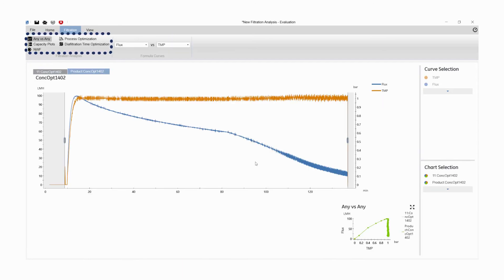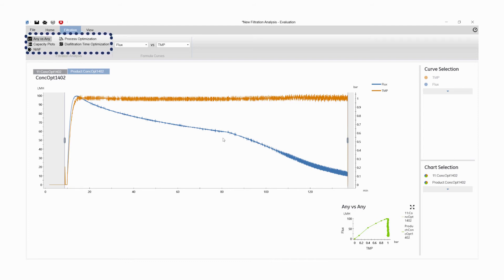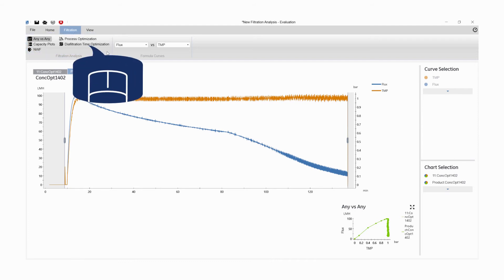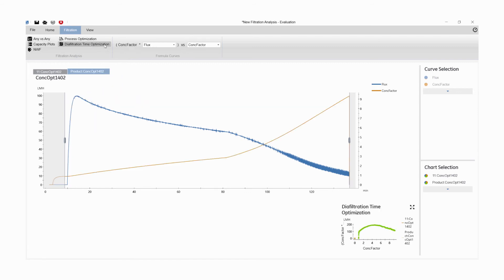The Any vs. Any algorithm will be applied to the selected results by default. Select Diafiltration Time Optimization algorithm from Filtration Analysis.